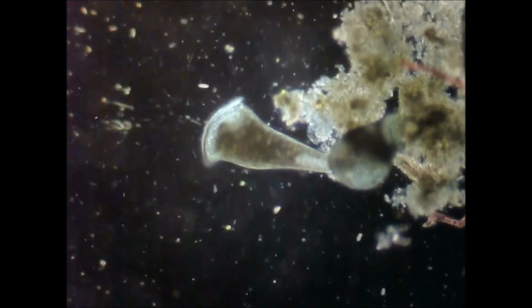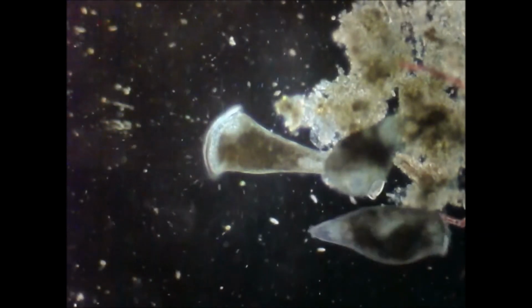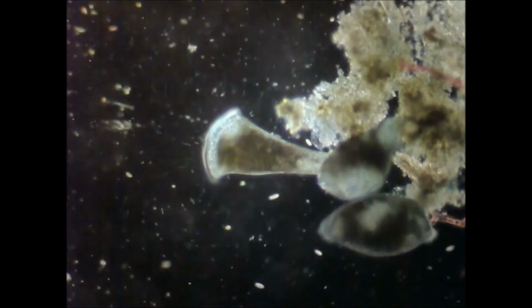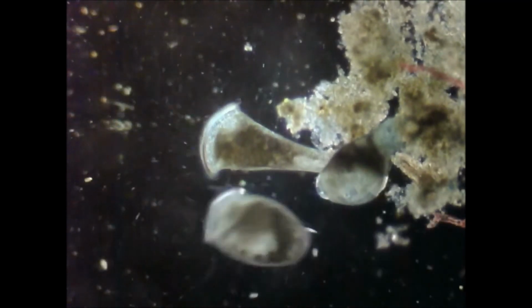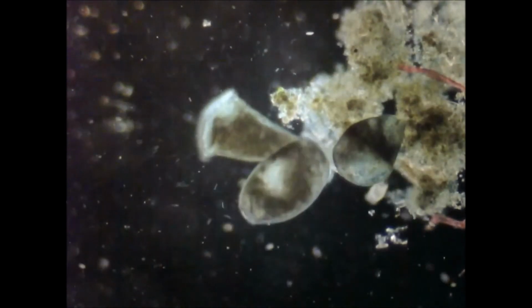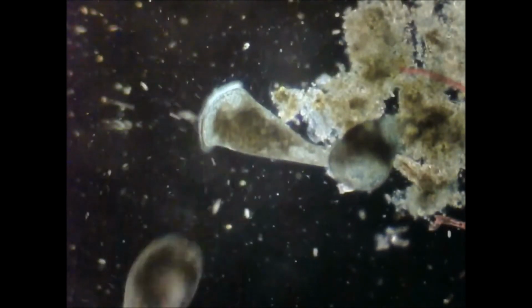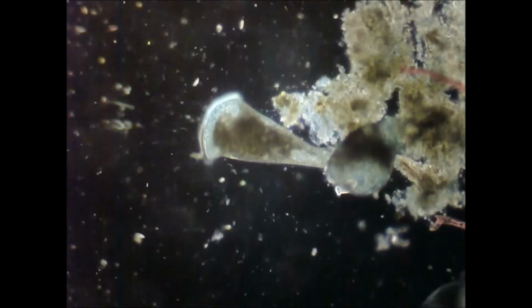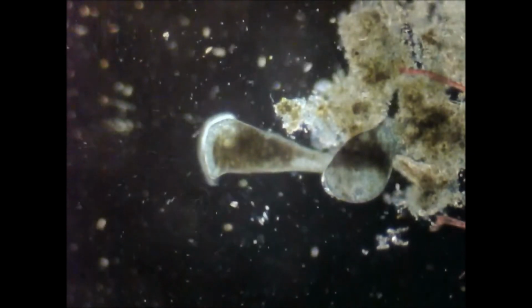And in this view, you see under dark field a much better angle of how they can feed. The cilia will create whirlpools of water which pull particles of food in, and they have a mouth called a buccal funnel that we'll see better later, and that allows them to feed. You see the barrel-shaped Stentor swimming away there. When food's not plentiful, they'll just detach from that mat of bacteria and swim around.